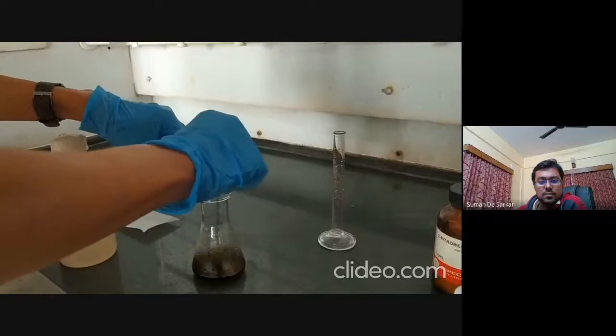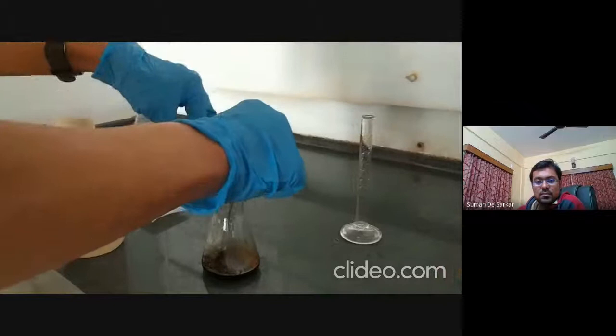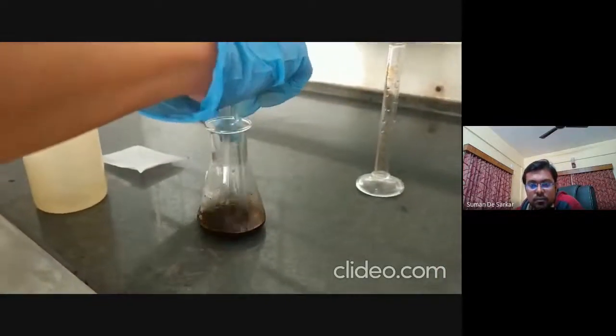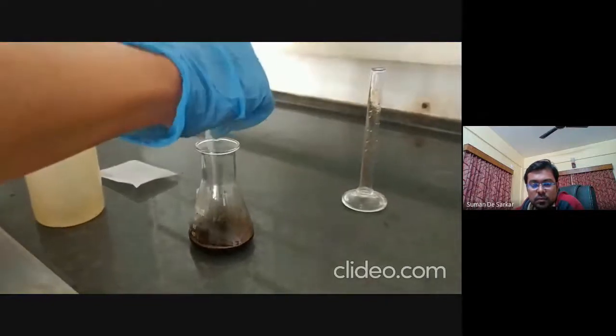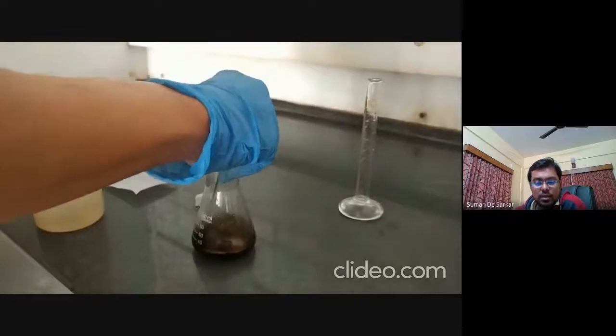So this is a condensation reaction, a very fast reaction. Already you can see the indigo is precipitating out of the solution. Yeah, it's so concentrated it appears to be black, right?